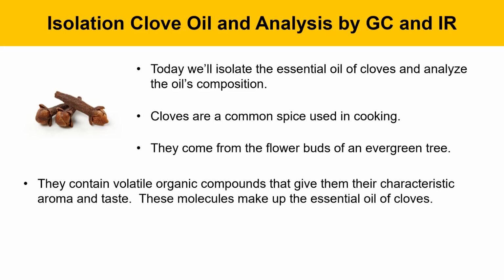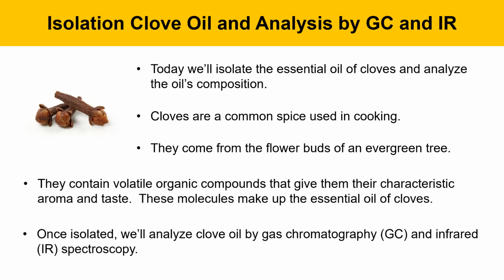They contain volatile organic compounds that give them their characteristic aroma and taste. These molecules make up what's called the essential oil of cloves. Once isolated, we'll analyze this clove oil by gas chromatography, GC, and infrared spectroscopy, IR.